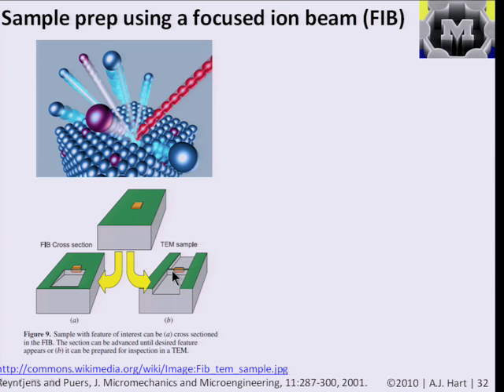I don't have a picture of a focused ion beam here, but you can imagine it essentially as an SEM, a vacuum chamber that can take a picture while you have another beam coming in that lets you machine things away. So you can watch the SEM image and drive the FIB, and you basically see material disappearing before your eyes as you cut it away using the ion beam. It's not a perfectly clean process. All these atoms also result in junk, so you get some small scale junk in the process as well.